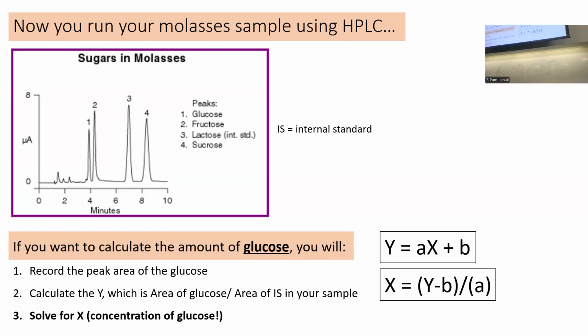When preparing that experiment, it's always the same amount of lactose to all your samples. You don't not do it. The same concentration, to correct for any experimental error that was subjected to everything in your solution. So it's the same concentration, same volume of the solution goes into your standards and your samples.